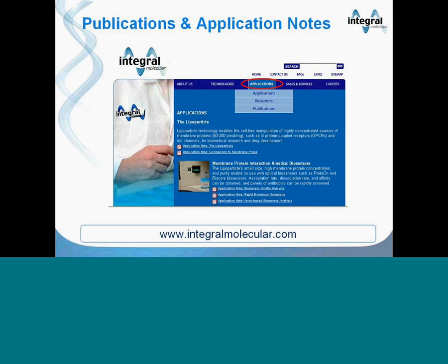We've briefly tried smaller molecules, but again, I think because we're really close to that limit of detection, it's just not sensitive enough to see small molecules. But if you turn it around, if you could somehow attach your small molecule to the surface of the chip and then flow the lipoparticles across, that's an extremely sensitive assay. So you could screen a small molecule library that way.